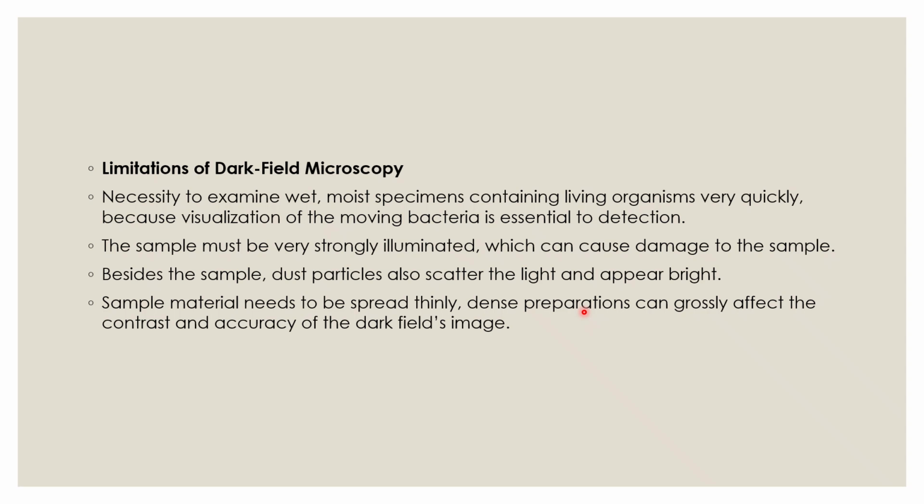And then you have to take a very thin film when you want to observe in the dark field microscope. Okay, if it is even a little dense preparation, you cannot get that contrast, or you cannot get the effect of the contrast and the accuracy also. As a result, a very thin spread has to be there. Okay.